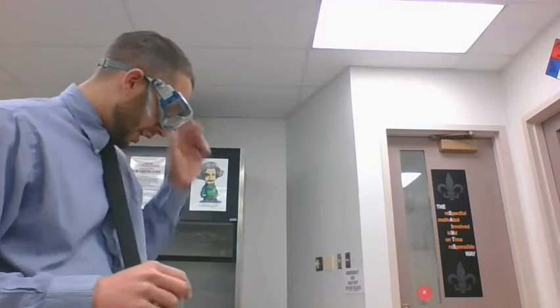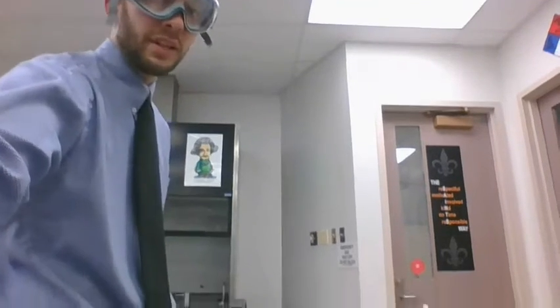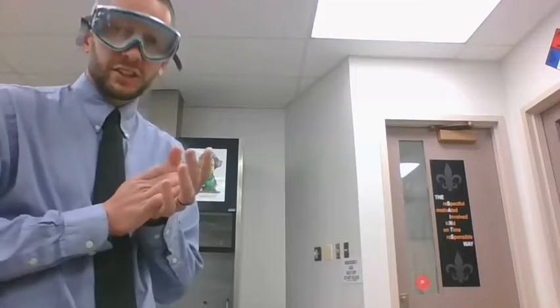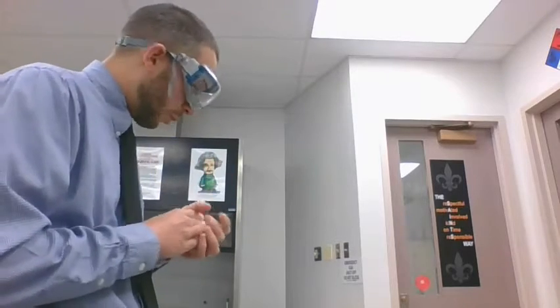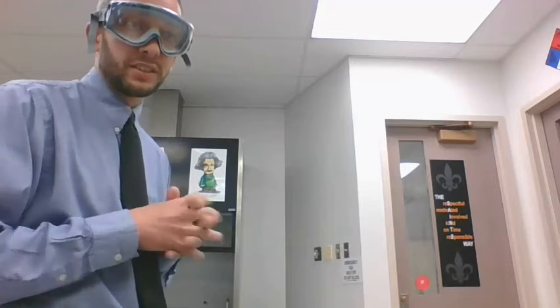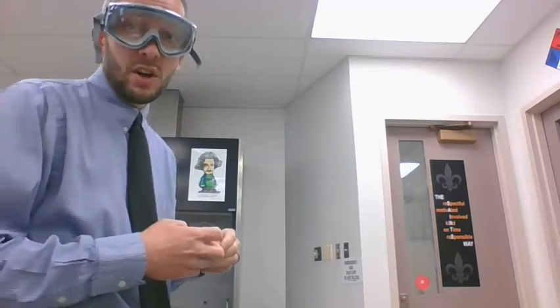So what you need to do on your lab assignment is to figure out the type of reaction that occurred and then what the products were. There's space for two products. If one wasn't there, you can just cross it out and say that wasn't there. Okay, so that's the first experiment on today's lab.